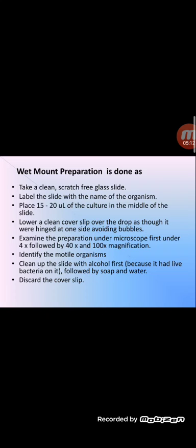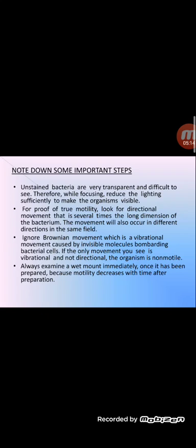Then we have to take care of some important steps. Here we are using unstained bacteria. We already know that these bacteria are colorless and highly transparent, so they are difficult to see. Therefore, while focusing, reduce the lighting sufficiently to make the organism visible.